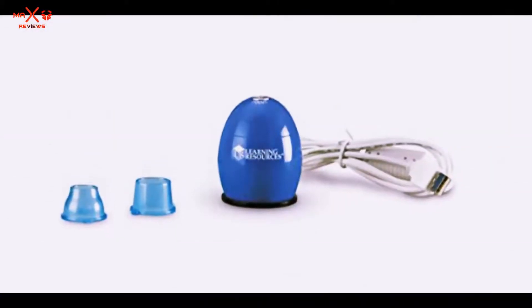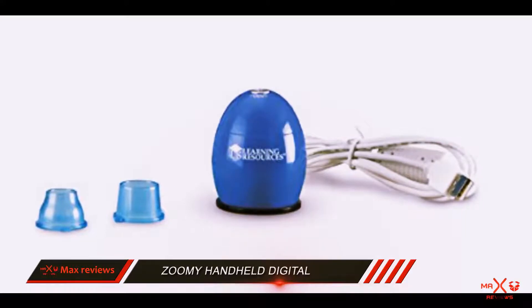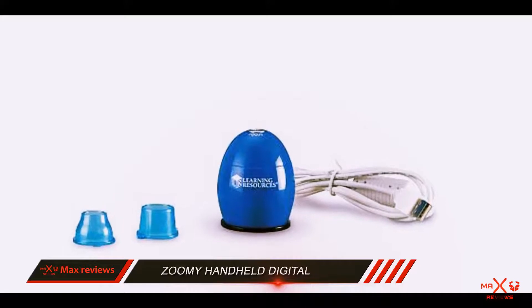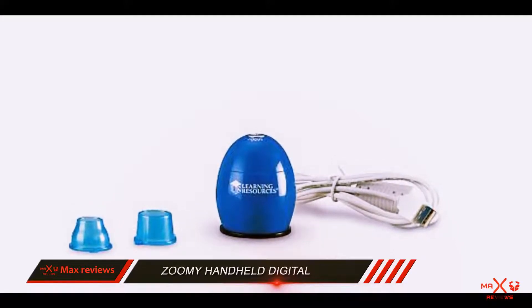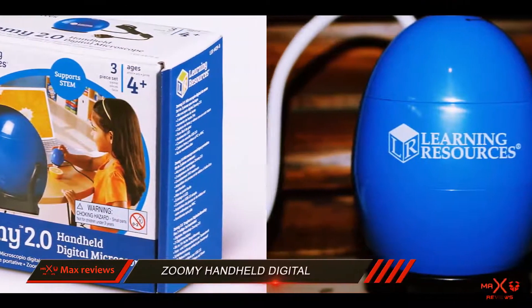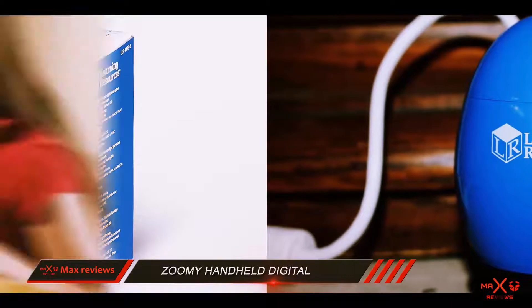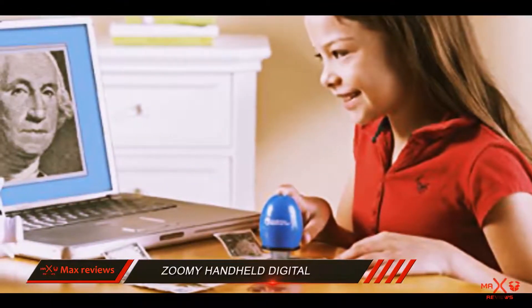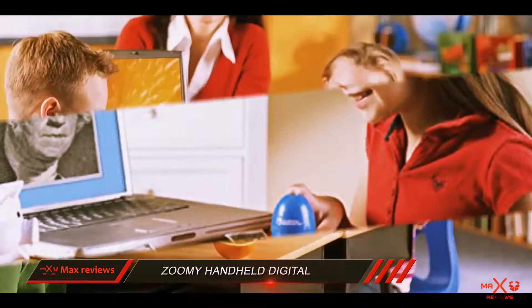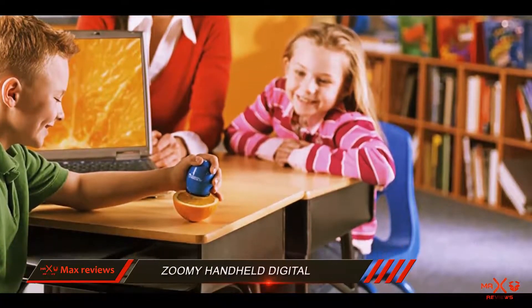The Zoomy Handheld Digital Microscope — a microscope for young learners who are always in search of a portable device. The Zoomy Handheld Digital Microscope provides a new interactive and smart way of learning for your children. Compact enough to fit into the hands of a child, this device can easily be operated with one hand. As a result, children can use the other hand to manipulate the object that is under observation. The Zoomy Digital Microscope has the ability to magnify an object up to 35 to 53 times its original size.